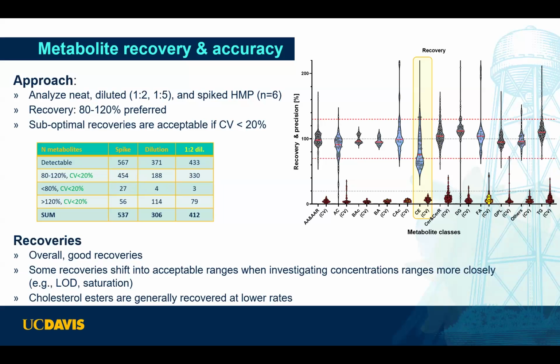If you now use your matrix and you spike it with another matrix with a given concentration, we come back to the concentration differences between the two matrices I mentioned in the beginning. So now we can't control how much we spike, in the sense that you have a given concentration in each of the plasma samples, meaning if you have a metabolite that is highly abundant in the milk, but also highly abundant in plasma, you may see a spike, but you also have a high possibility to run into detection limits and saturation effects so that you may not get a good result.